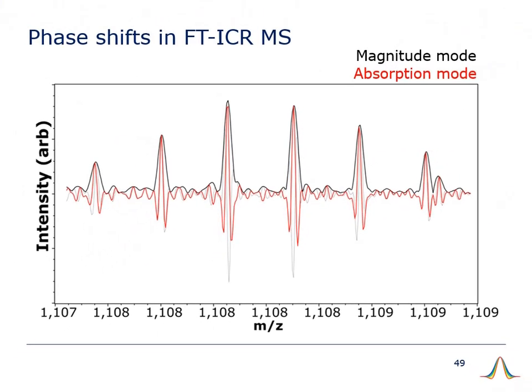So because these side lobes can give you such great insight into the quality of your spectrum, my advice is to make use of them if your data system allows you to see them. For presentation purposes, however, because seeing the side lobes doesn't really have any effect on the peak positions, and because many people are not commonly used to seeing negative side lobes in mass spectra, it can be useful to squash those side lobes down, or even delete them entirely.